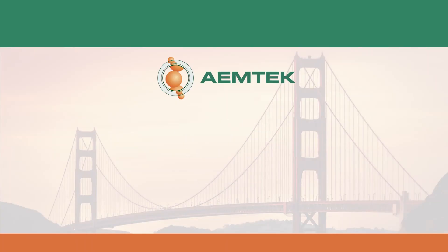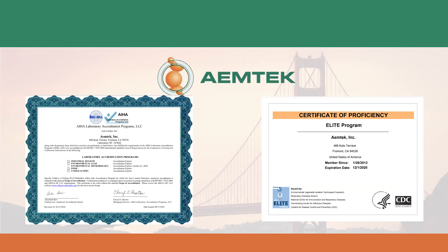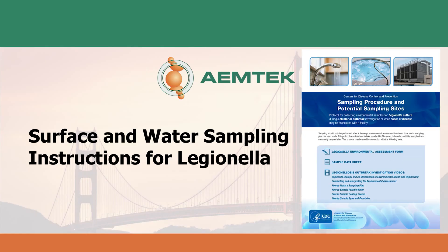We are accredited by AIHA for Legionella testing and certified by the CDC ELITE program. This video will demonstrate how to perform surface and water sampling for Legionella testing. For more detailed instructions, we recommend following the CDC's Legionella sampling procedure.